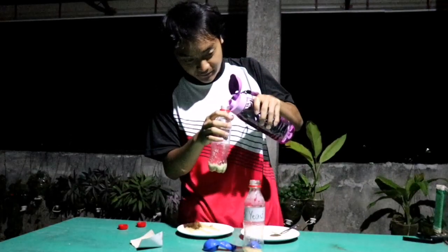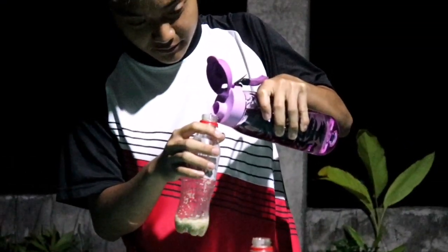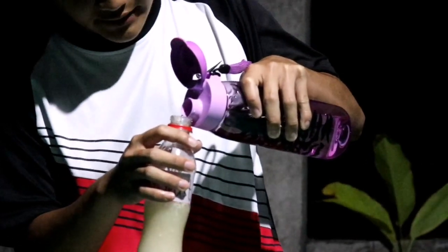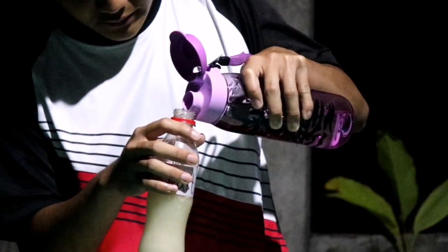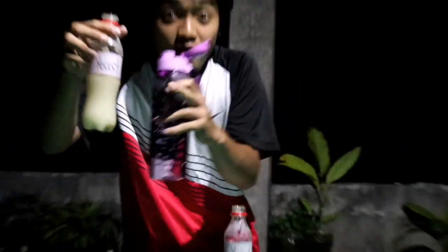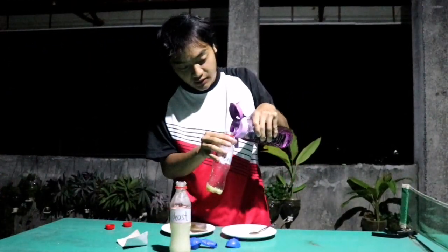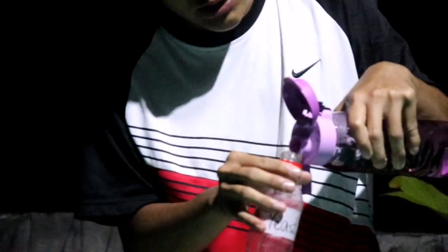Lagyan natin siya. Nilalagyan natin ng warm water yung with yeast na nakasulat. So, hanggang dito lang yung tubig ha. Dapat parehas yan, of course.